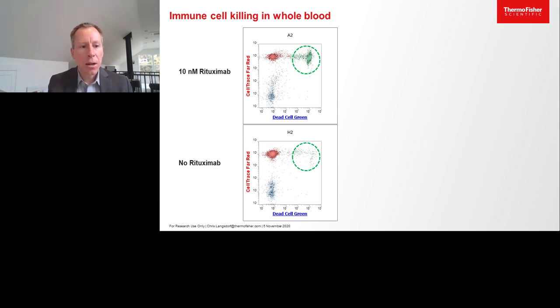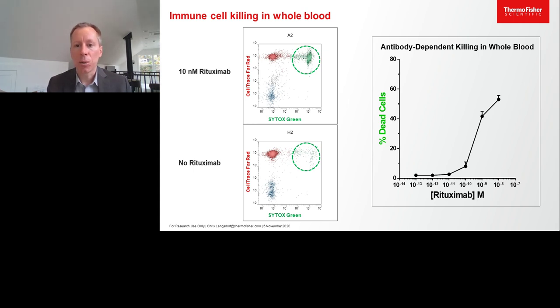And indeed, that entire 96-well plate was a dose-response experiment to characterize what concentration of this antibody is required to encourage, in this case, probably an innate immune response by the components of that whole blood, most likely driven by complement proteins, natural killer cells, and potentially some neutrophils as well.